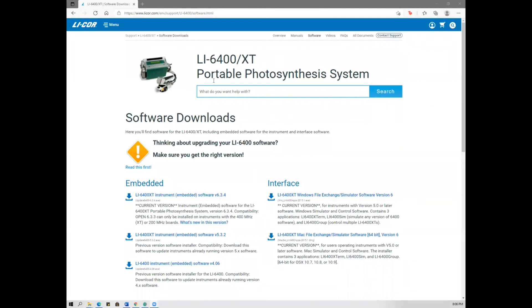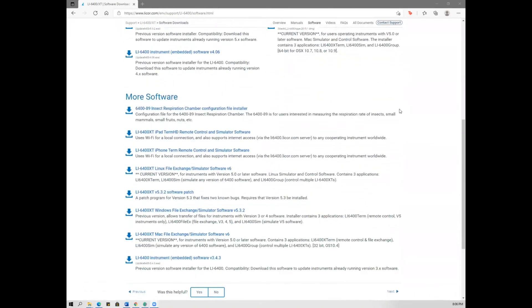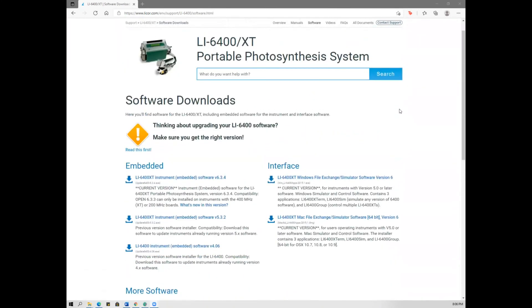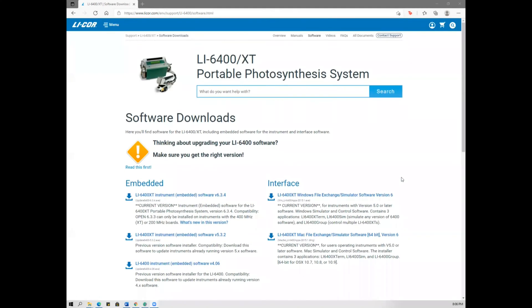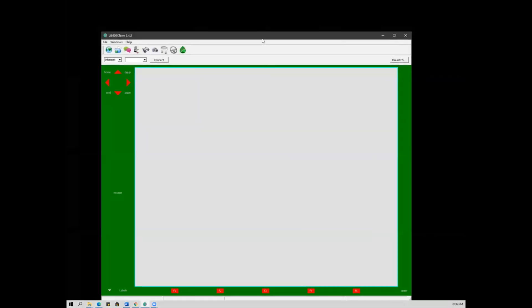This is where you can download LiCor-related software. All the software is free. You can navigate up and down to find the software you need. There are versions available for both Windows and Mac. This is the software I used to collect data from the LiCor to my computer.